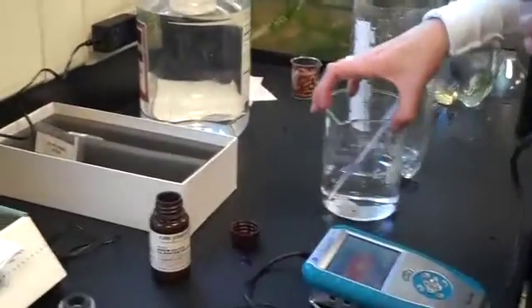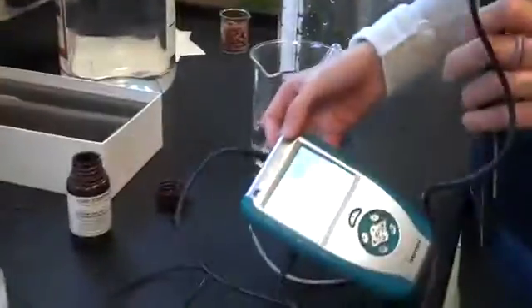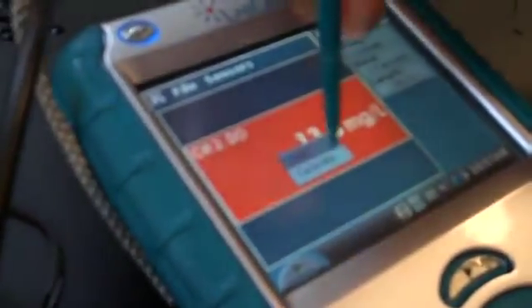But before we do that, we're going to use our LabQuest. You have to go and pull the stylus out from the back to select the calibration mode. If you click on the sensor, an option will come up to zero or calibrate. So we're going to choose calibrate.